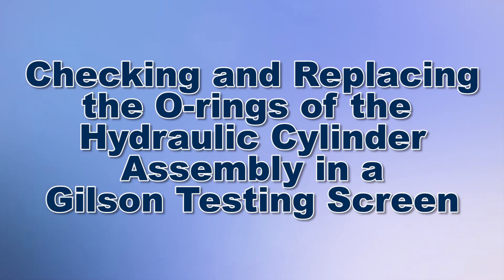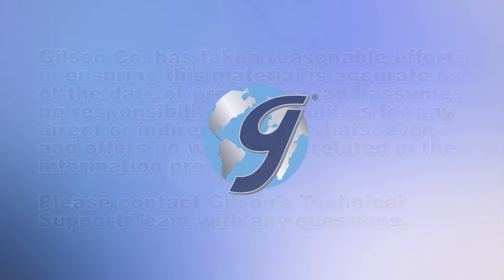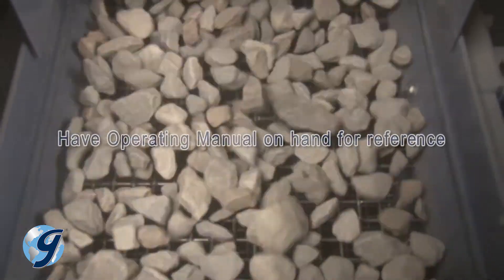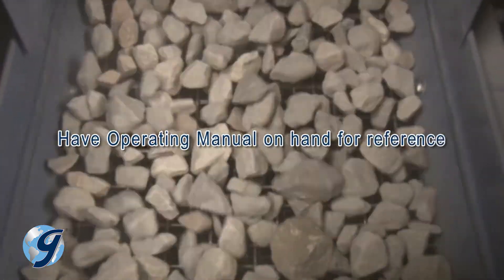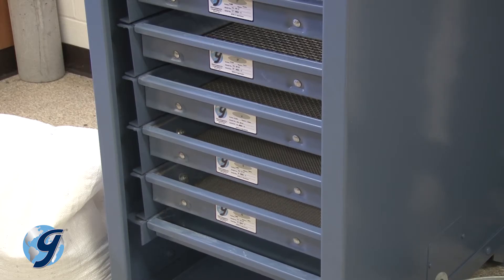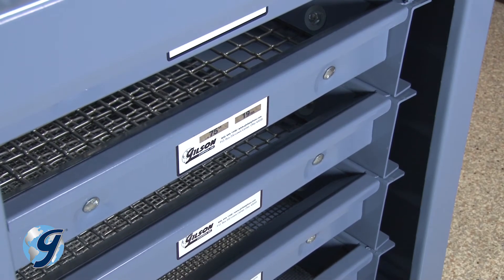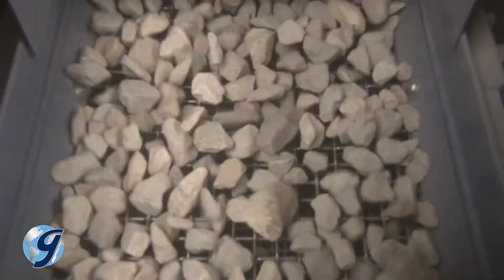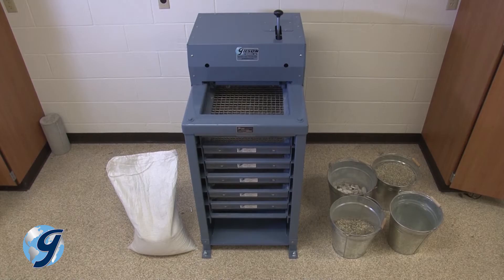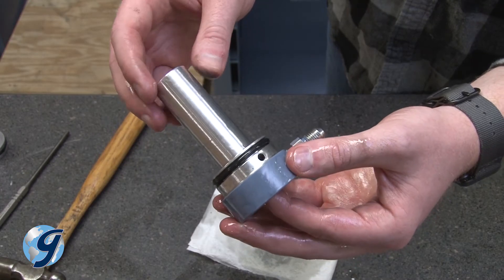Today we're going to check and replace the O-rings in the hydraulic cylinder of your Gilson testing screen. The Gilson testing screens are rugged, tough machines that will provide years of service if installed and maintained correctly. In testing screens with hydraulic clamping, a quick acting hydraulic pump system is used to clamp and release the screen trays. If you find your screen trays becoming loose during testing, can't clamp them tight enough, or have hydraulic fluid appearing near where you load the bulk sample, the hydraulic cylinder's O-ring may be worn.